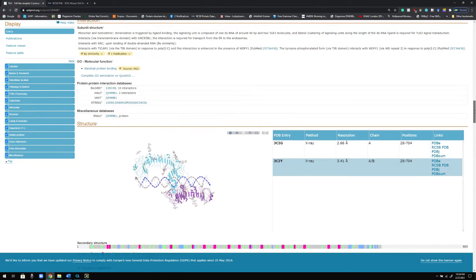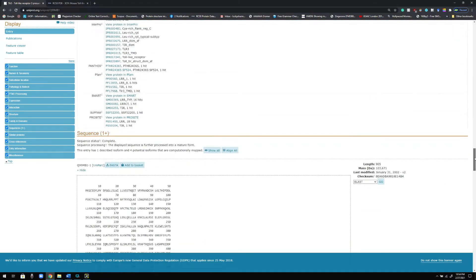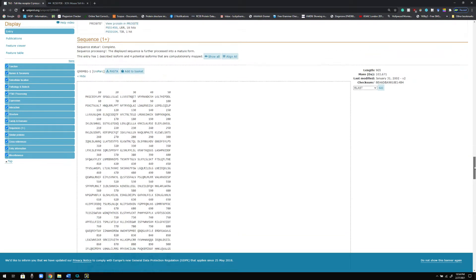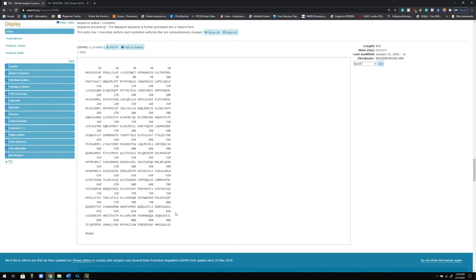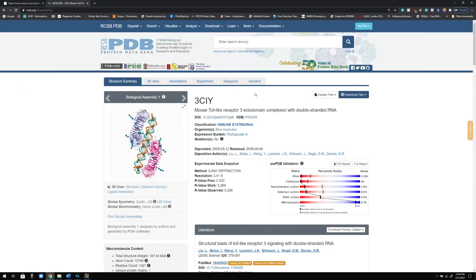You can also get the FASTA sequence from the UniProt website very easily — here is the FASTA sequence as you can see, and you can download it from here. UniProt gives you the full FASTA sequence of the protein. If you want the FASTA sequence of the RNA, you can use the Protein Data Bank. Now I'm going to show you how you can do the same thing using PyMOL.